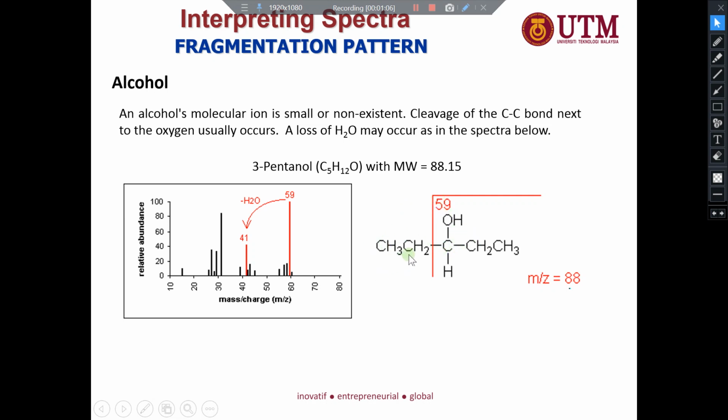Kalau contohnya kat kawasan ni kita ada combine, here is carbon, here is another carbon, so this one become tertiary, then here kita akan potong kat sini. Okay, kalau contohnya we have another carbon over here, definitely dia akan potong kat sini lah, yang ni become cationic. Alright, if that is the situation happen lah.